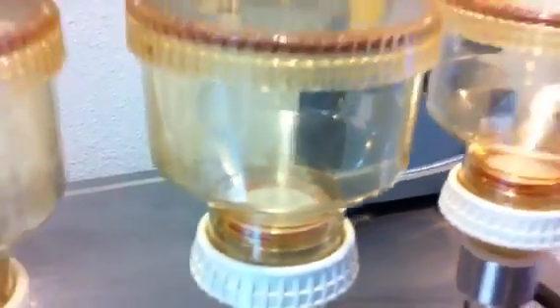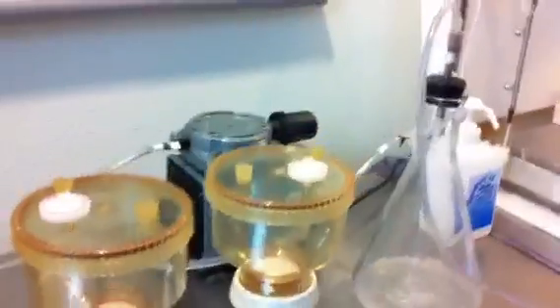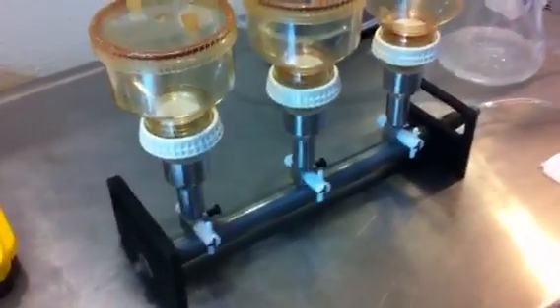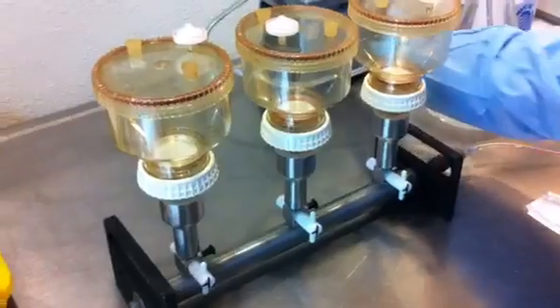They are just about done — and that's done. Now we can take the filters off and we are going to put them into a petri dish.